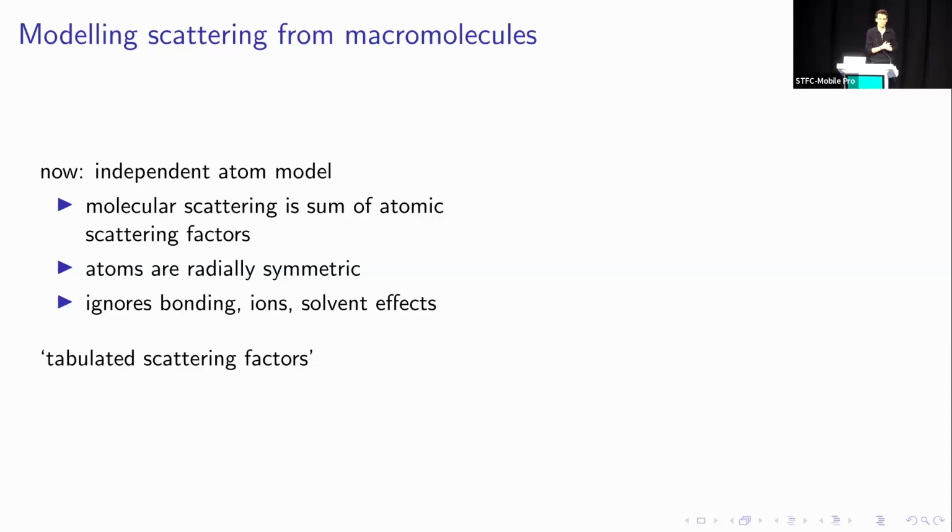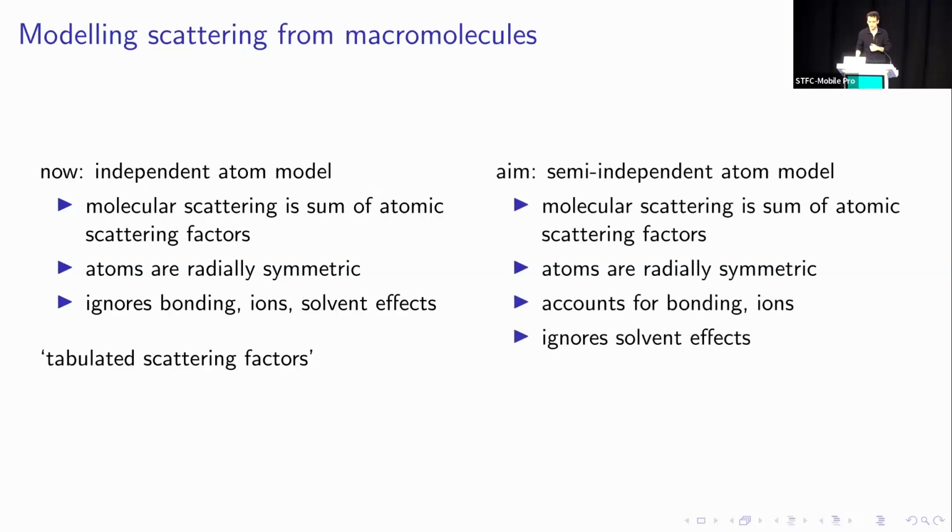And so we can pre-calculate these scattering factors for every element and tabulate them. And then when doing calculations, we can just refer to these tabulated scattering factors. So I'll refer to this current model as the tabulated scattering factors in the talk.